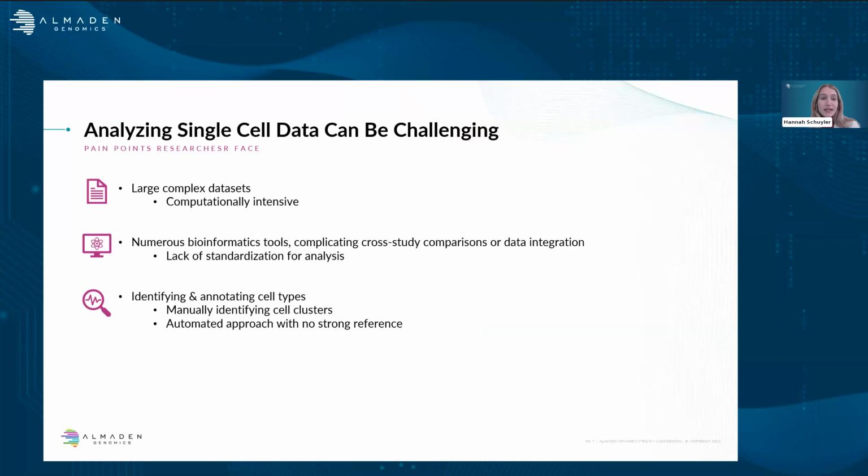So while single-cell sequencing is very transformative with a lot of potential, there are several challenges that we hear from researchers that they face when it comes to analyzing these complex data sets. The first is that these single-cell data sets are typically quite large, making storage and processing very computationally intensive. This means longer computation times for researchers, as well as potentially higher costs in actually analyzing this data.